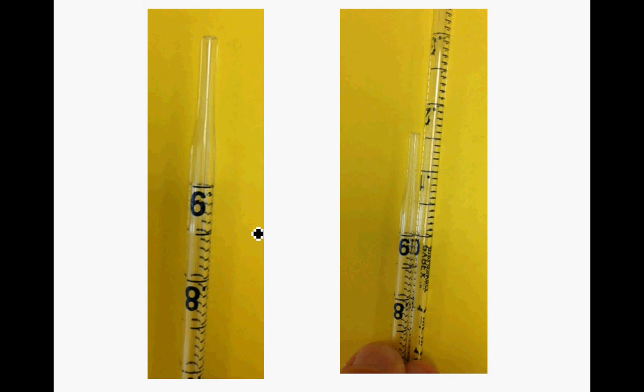There's an occasion where the meniscus is only right here at the tip. So here's the tip, and the meniscus would be right there, where this is going to be water and this is going to be O2. Can I read that volume? The answer is no. So if that's the case, you're going to have to put another pipette right next to this one and line it up so that I can see where that is. So the meniscus would be right there.